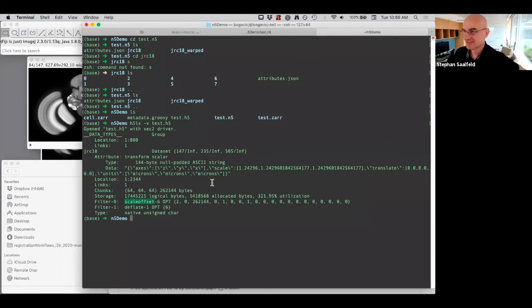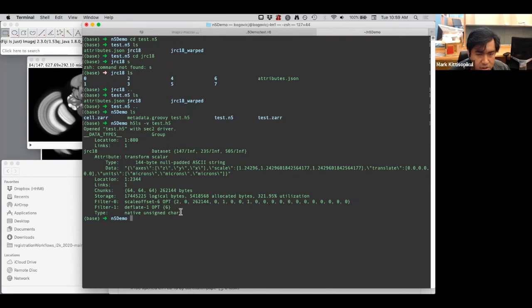Probably default. I think that shifts and scales and multiplies the data, if I understand what it does. It can change how well your data compresses, so it's just an interesting filter to have in there.